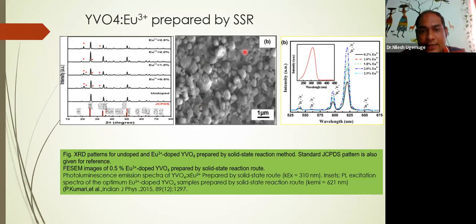Another thing is the same micrograph that you were talking about. Here you will only see the particle size, meaning whether particles are agglomerated, and what their shape is, rod shape, spherical shape, tetragonal, tetrapod shape, whatever it may be. These things you can see with the help of the SEM. But it's a surface morphology, not an internal structure. Again, particle size can also be calculated with the help of XRD. You may know about the Scherrer formula, so that you can also use.